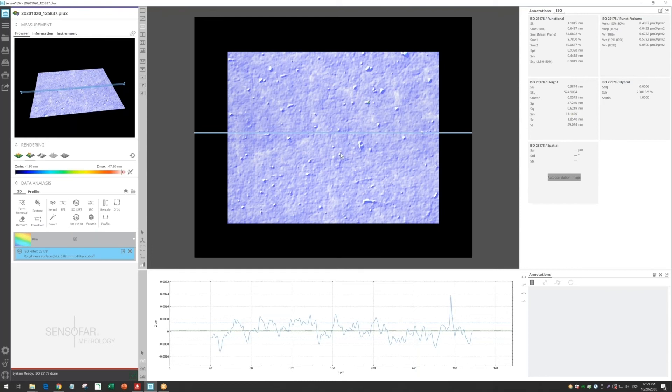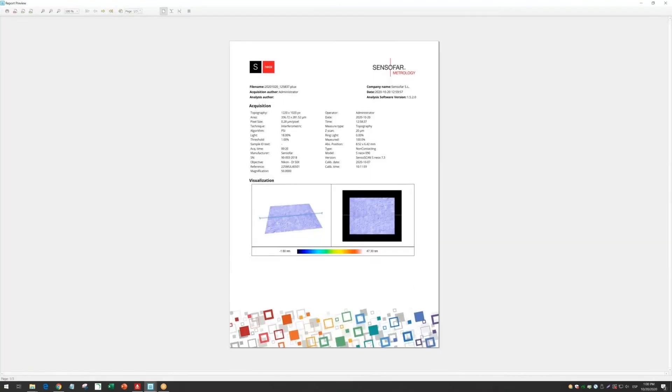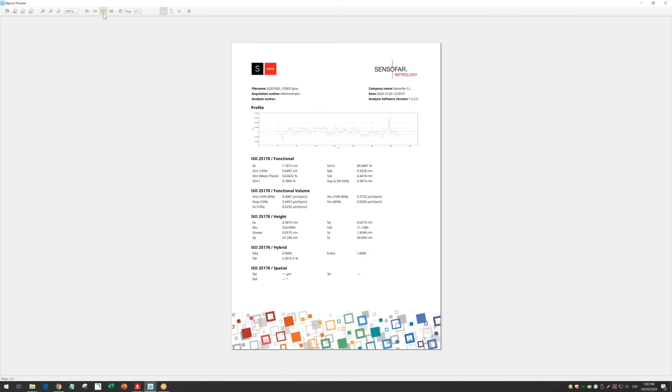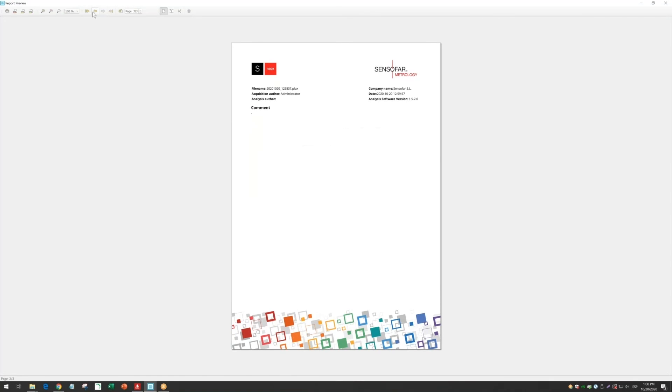If you want to have a very nice report of that, you just need to click here on the top left, print, and you can have a PDF report with these two images, the profile, and if you go to the next page, you will get all the values.